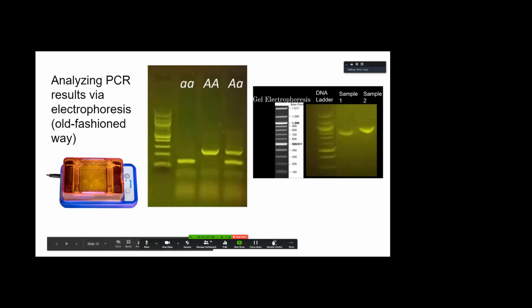So then after it's done, you have to know what did I make? Did it work? Is there a virus there? How do I know? So I'm hoping this looks familiar to some of you. Electrophoresis is the name of the method. We have these at LBHS, and they are for separating DNA based on size. So this first picture here is electrophoresis. That's from the company that makes it, miniPCR. So that's professional quality. And this over here is Raul Campos's team. And there's their DNA. So you see it looks about the same.